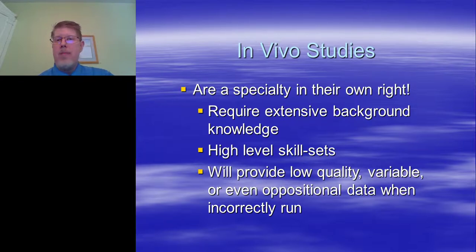And the thing with surgery is, 25 years ago, surgery was probably not as significant a component of most drug discovery pathways. But in this day and age, there aren't a lot of compounds that make it all the way through the discovery and safety process without going into lab animals that had some sort of surgical intervention. Could be a radiotelemetry implant for cardiovascular monitoring, could be a catheter for drug delivery or sample collection, but it's pretty safe to bet that at some point in the pathway, somewhere down the line, someone is going to be doing surgery. Boy, you better hope that they're doing it right. We'll talk about why.